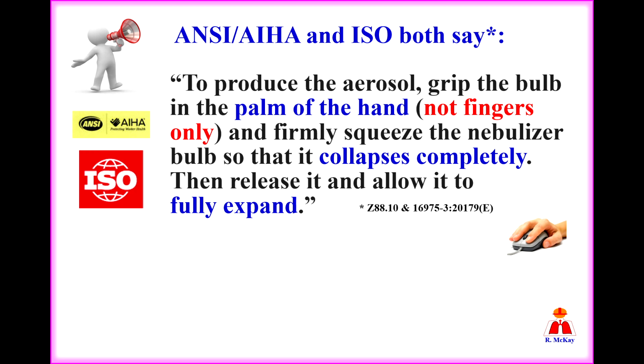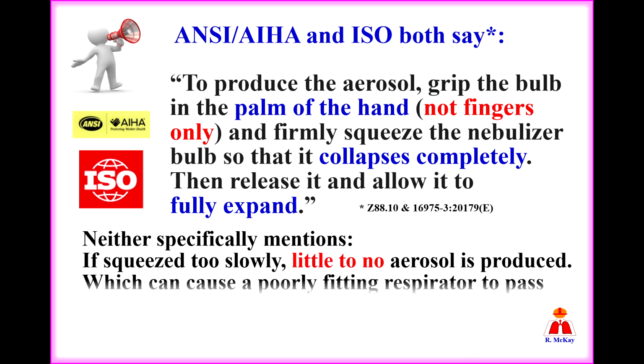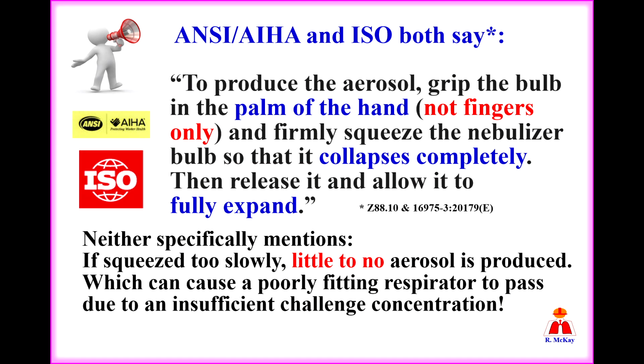There are guidelines by ANSI and ISO on respirator fit testing. They both say, quote, to produce the aerosol, grip the bulb in the palm of the hand, not fingers only, and firmly squeeze the nebulizer bulb so that it collapses completely. Then release it and allow it to fully expand. Neither specifically mentions that if squeezed too slowly, little to no aerosol is produced, which can cause a poorly fitting respirator to pass due to an insufficient challenge concentration.